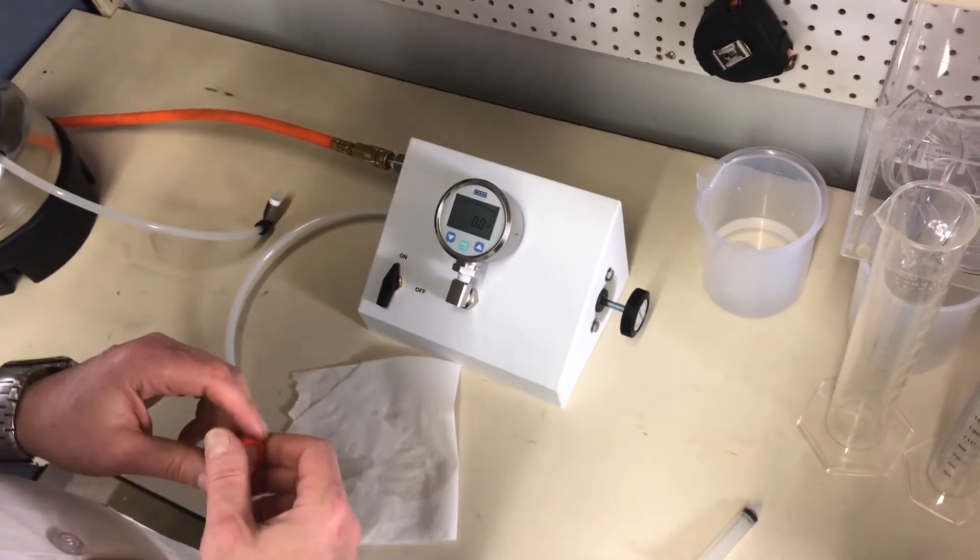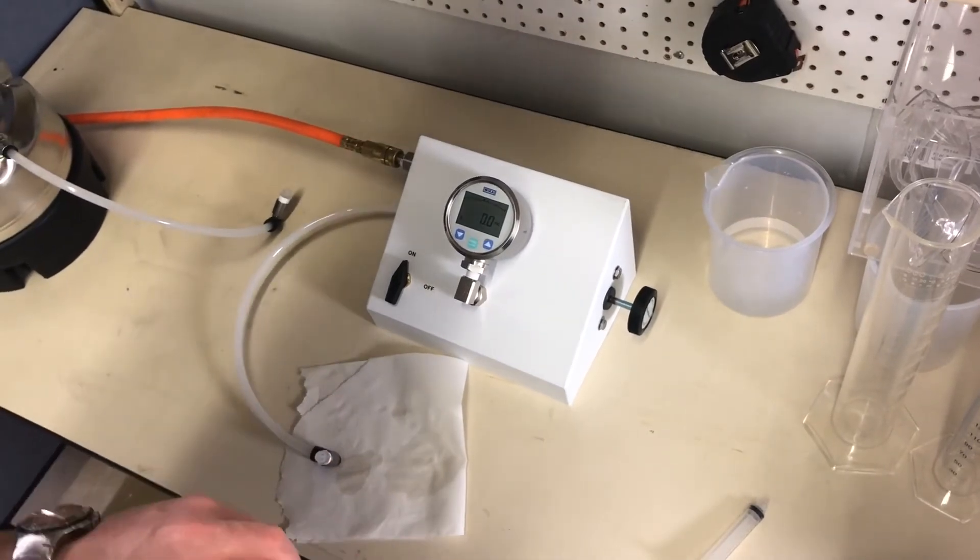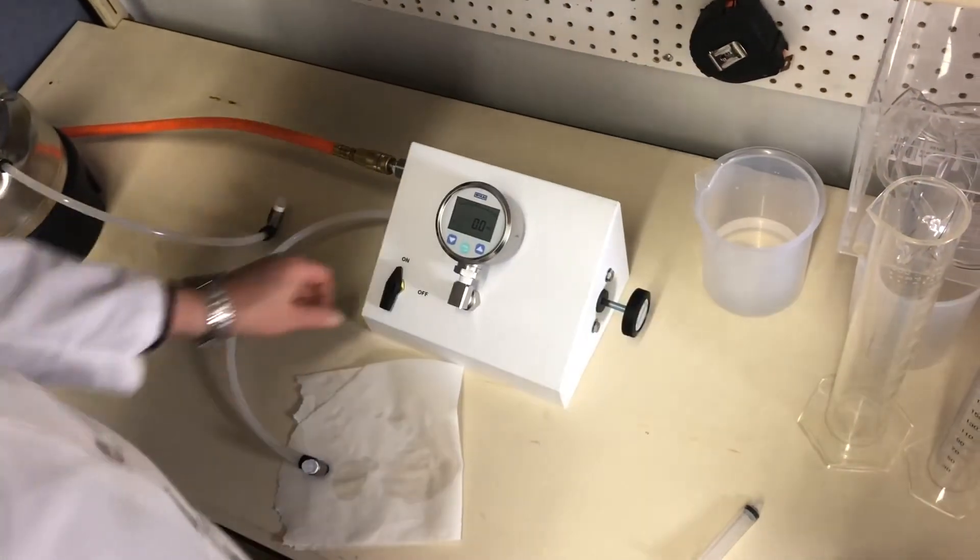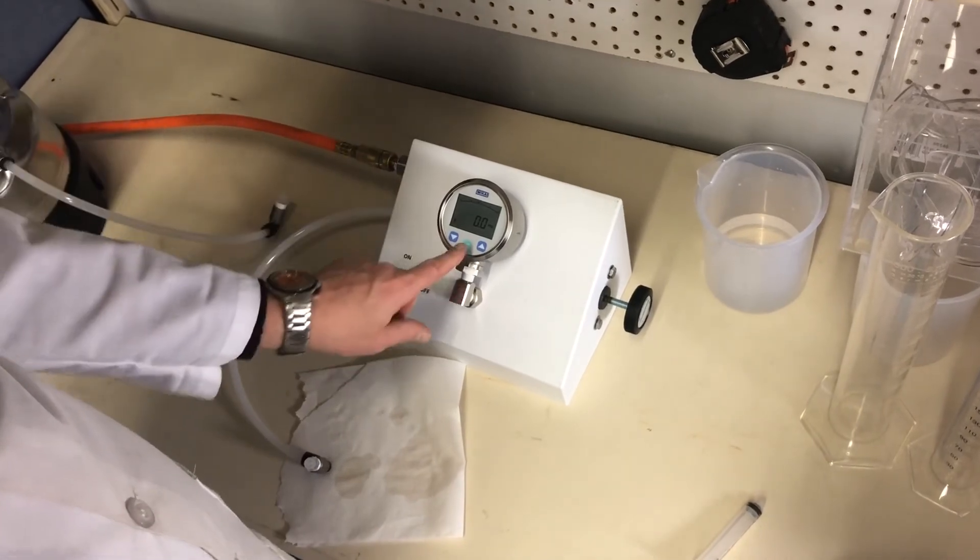And if you want to try another one, you can certainly do that. If you're finished, make sure the pressure is still reading zero. And then you just simply turn the air off and then turn the gauge off.